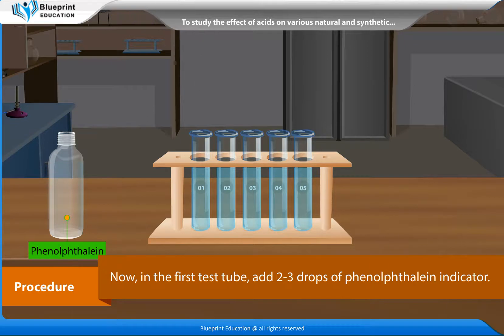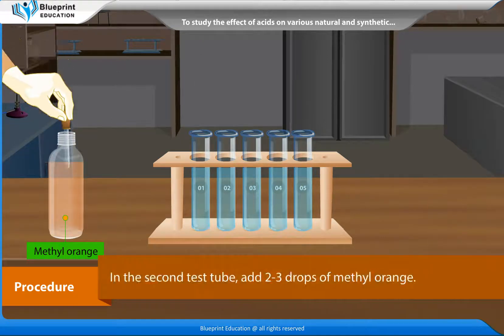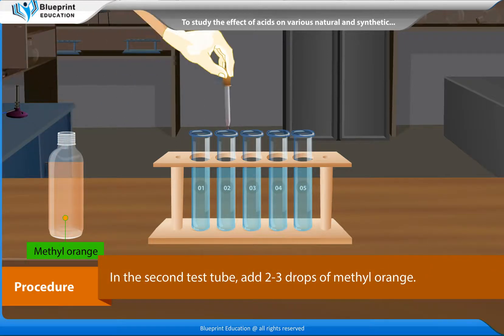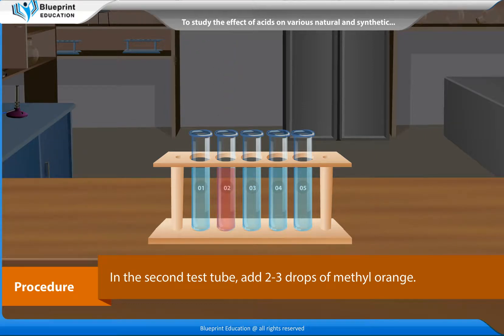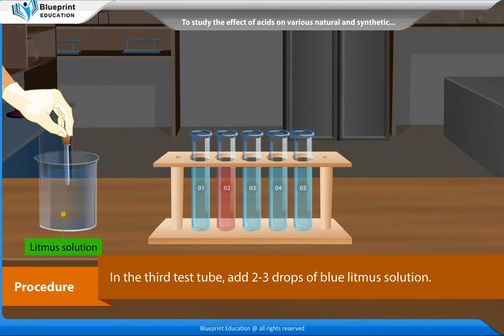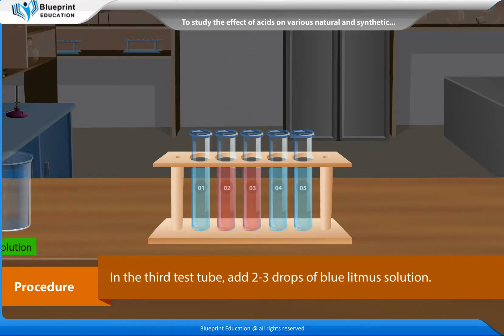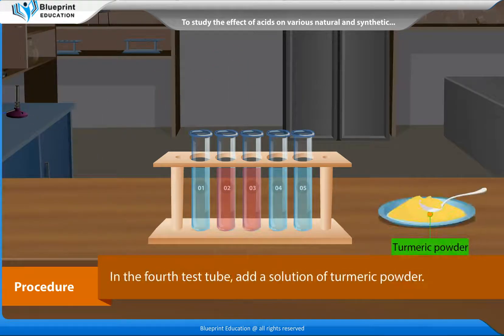In the first test tube, add 2-3 drops of phenolphthalein indicator. In the second test tube, add 2-3 drops of methyl orange. In the third test tube, add 2-3 drops of blue litmus solution.